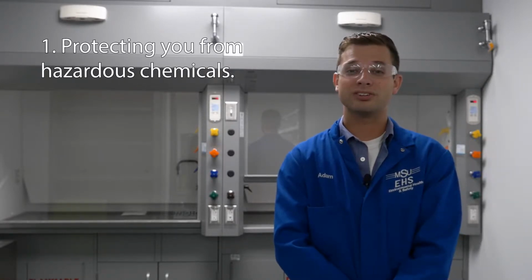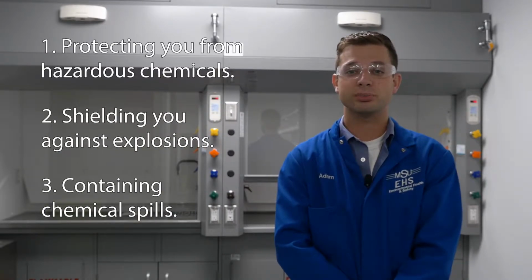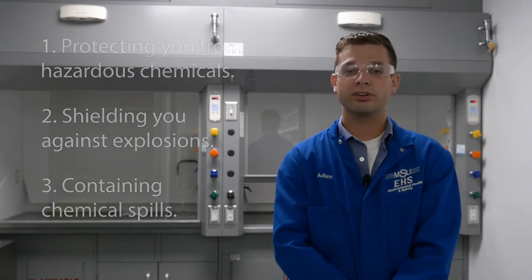Your fume hood is essential equipment for 1. Protecting you from hazardous chemicals, 2. Shielding you against explosions, and 3. Containing chemical spills. Each fume hood is a little different and it's important to understand how your fume hood works in order to best protect you from harm.